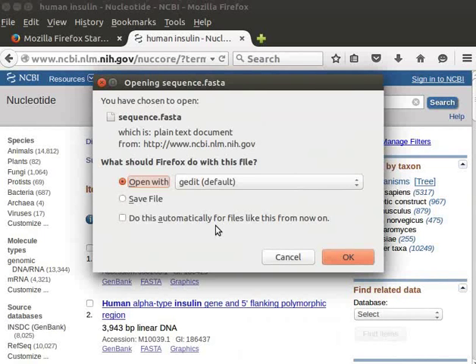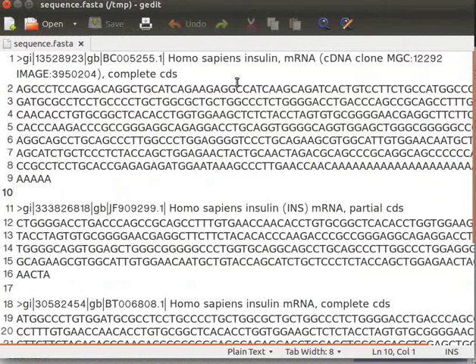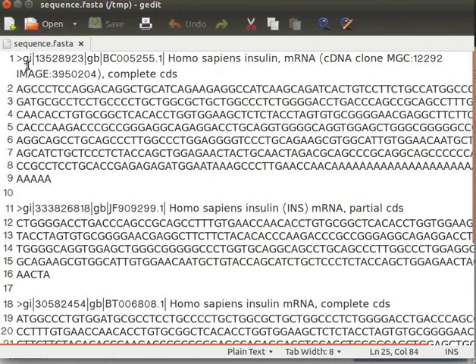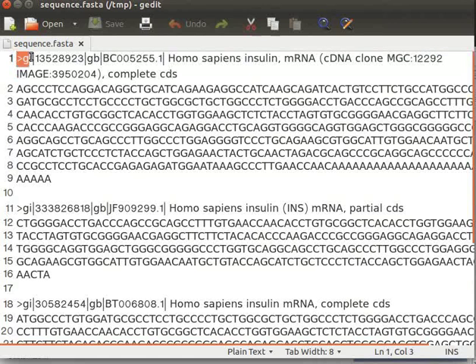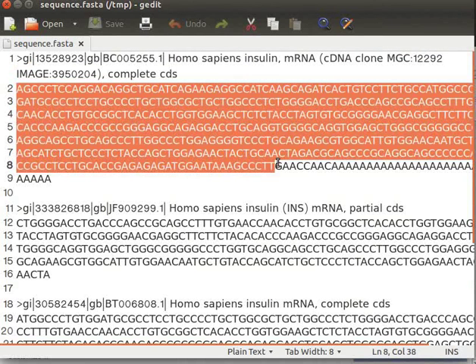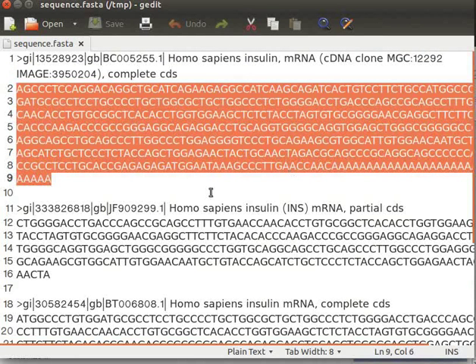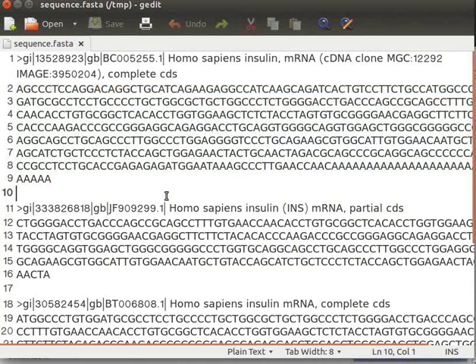A dialog box appears on the screen. Select 'Open With' and click OK. A file opens in a text editor. The file shows 4 records, since we had selected 4 files to download. The first line in each record is an identifier line that starts with a greater-than symbol, followed by a sequence. Save the file in your home folder as sequence.fasta.